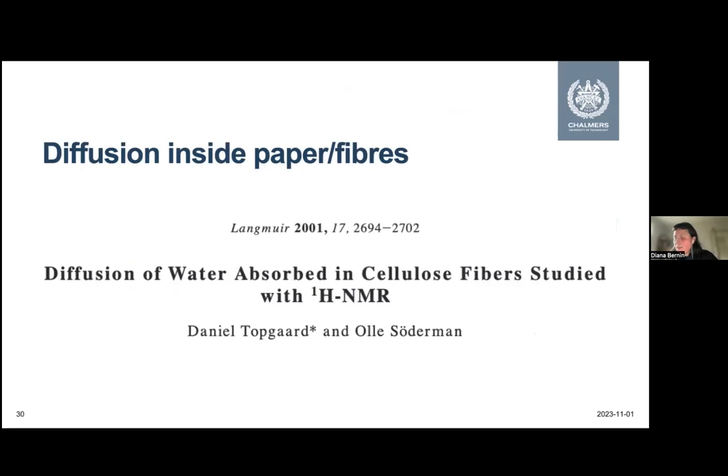Then last slide here. Excuse me. We talked a lot about diffusion, and the talk should be about diffusion, but it is, however, very, very difficult to measure diffusion inside paper or wood-based material as such.